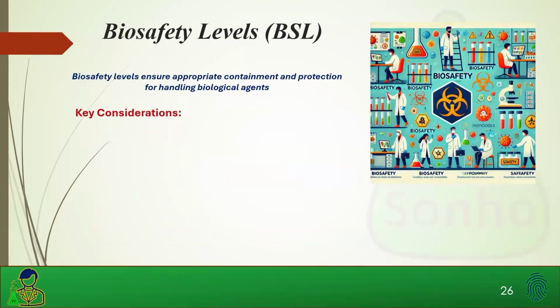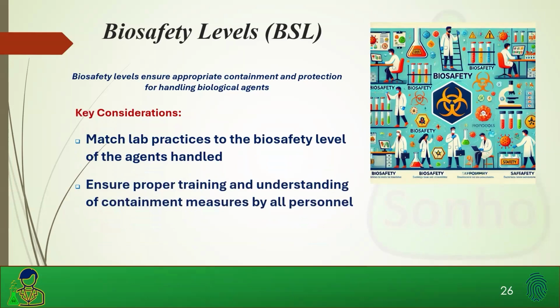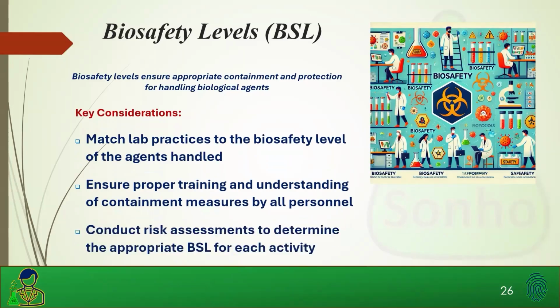Some key considerations. You need to match your lab practices to the biosafety levels of the agents being handled, and ensure proper training and understanding of containment measures by all personnel. All personnel should have the appropriate training to match the appropriate biosafety level. And conduct risk assessments to determine the appropriate BSL level for each activity.